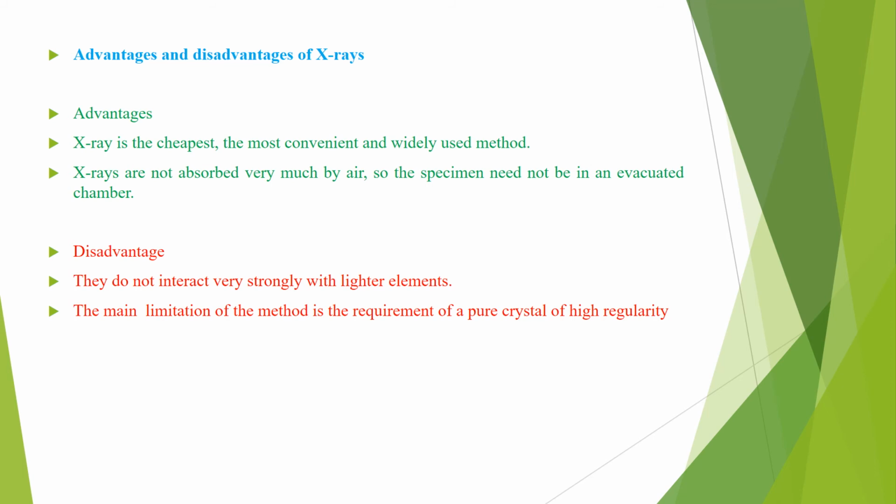So this is one of the main disadvantages of the X-ray analysis, that when we are studying the lighter elements, it makes it difficult to study because they don't interact very strongly with those lighter elements. The main limitation of the method is the requirement of a pure crystal of high regularity.